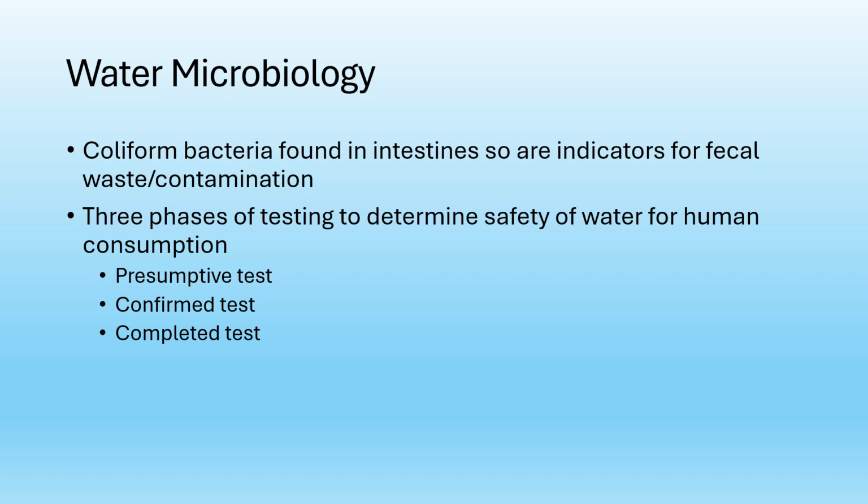Coliform bacteria typically are found in the intestines, and so it would be an indication of fecal contamination. Therefore, it's not suitable for human consumption. If you remember, there are three phases for the water testing. There's the presumptive test, the confirmed test, and the completed test.